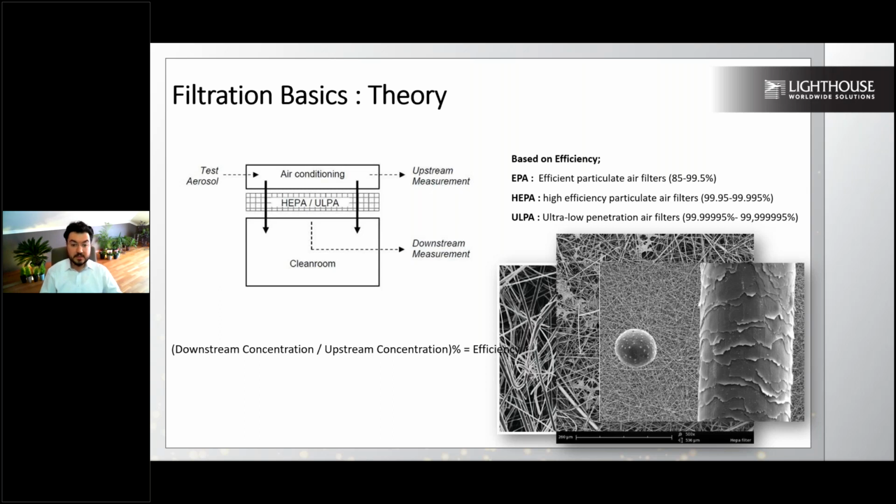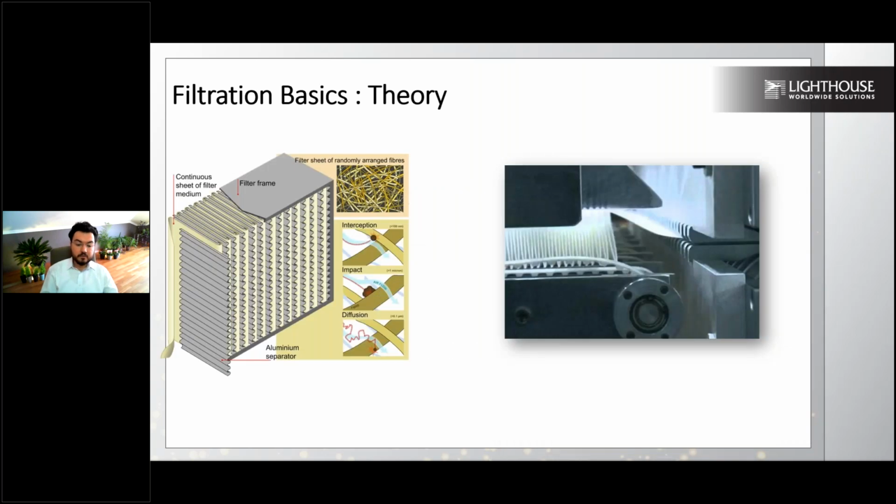It is so dense that these filters can easily capture 0.1 micron particles. When it comes to this point, filters are classified with an MPPS value. I will come to that later on, which means filters are so much more efficient at smaller sizes, and the MPPS value, which we will come to later on, will define our filtration efficiency. This is the lowest, our bottleneck for filtration technique.